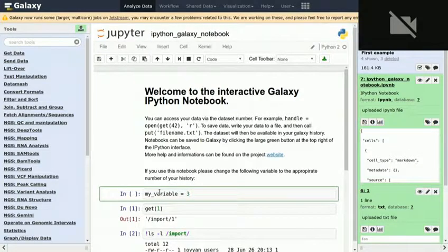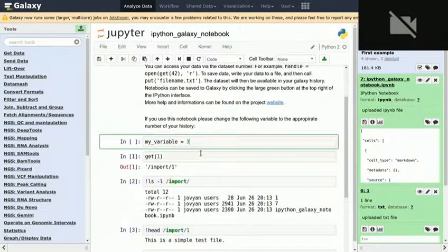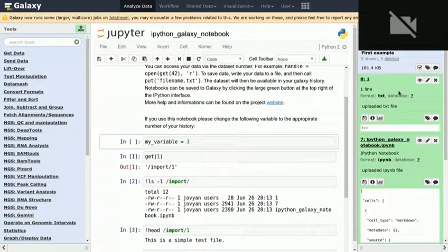And I hope this is easy enough to be also executed by biologists or someone that is not able to program. But as soon as you do that and you annotate it, you document your stuff, and the user only needs to change this number, just replay the notebook. Yeah, and because we replayed it, there should be a new data set here. Yeah, this one. You see, we just re-uploaded it again. So this is reproducible, and it's coding, and it's in Galaxy.